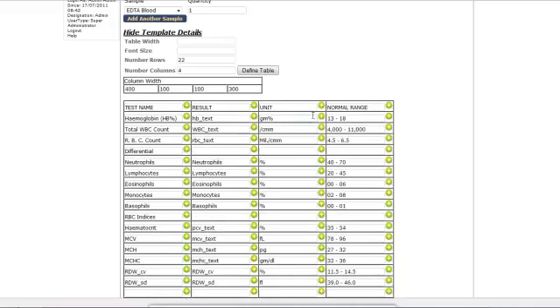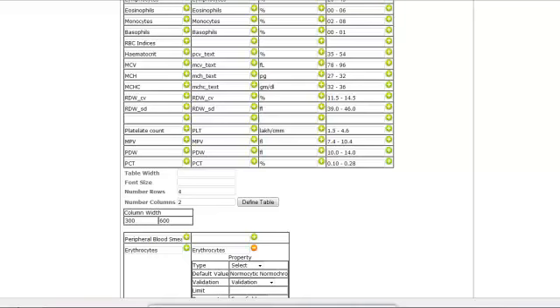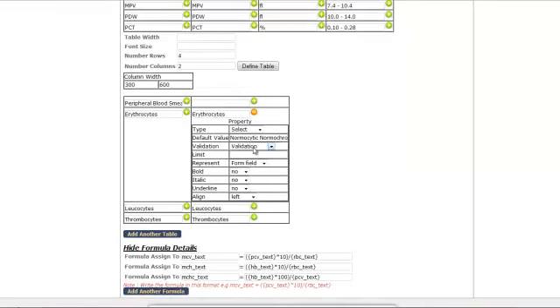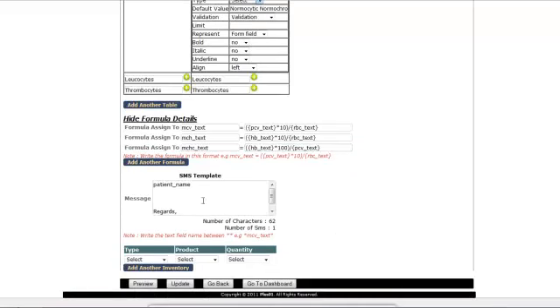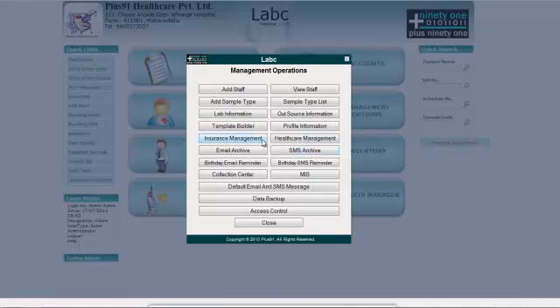You can also create formulas, just like in Excel over here. As you can see, you can also create drop-down menus directly inside the template. Below we can see some formulas which are given. These formulas work automatically in the add page of the template. You can also define SMS templates complete with the auto picking of parameters or values directly from the template once defined in the given format. You can also attach certain inventory for auto debit to this template.